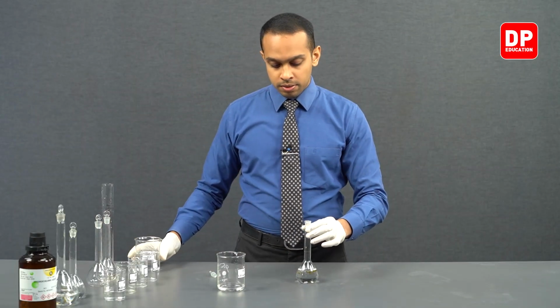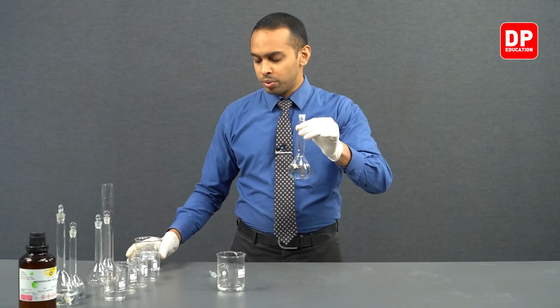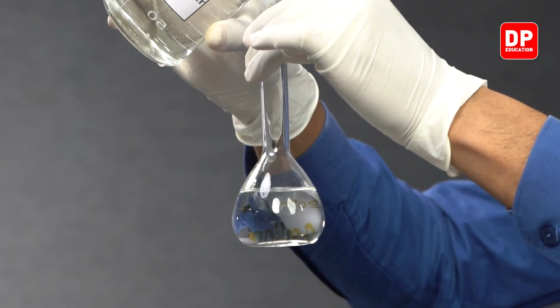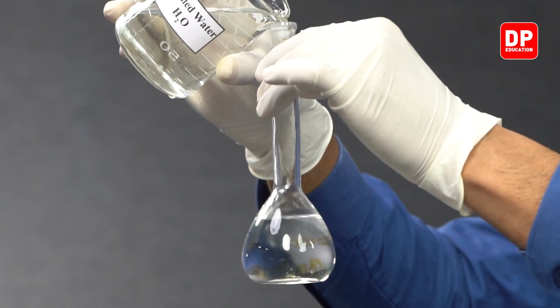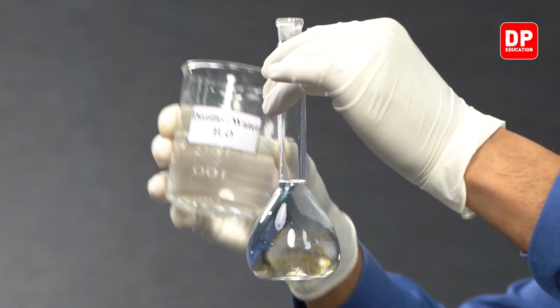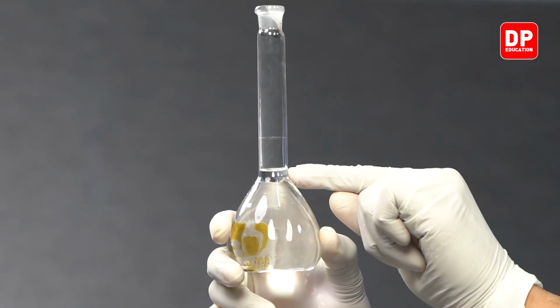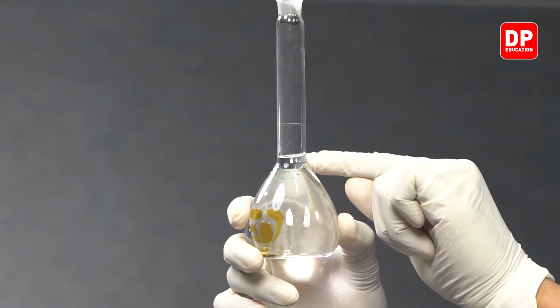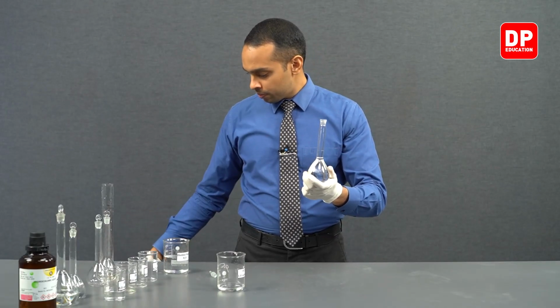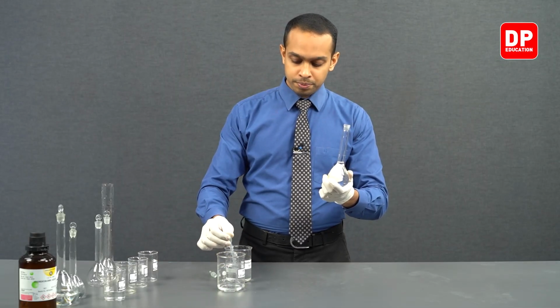And after that, since we still haven't reached the narrow end of the volumetric flask, we can proceed to add some water with the use of this distilled water that we have over here in a beaker. After we reach the narrow neck area of this volumetric flask, we will proceed to add our distilled water with the help of a dropper.